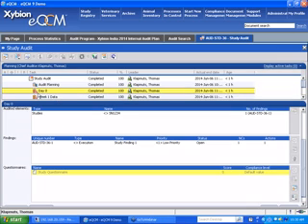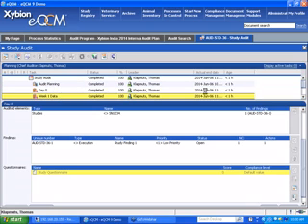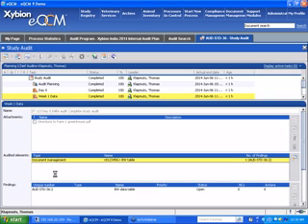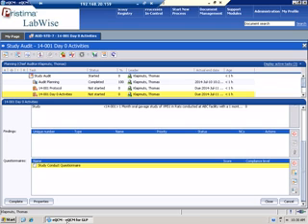And so here's an audit that I've done. Again, the same thing that I'm working through right now, day 0, week 1 data. And as I went through, everything's completed. We have the audited elements and then findings. So what I'll do is go back to the audit I was working on, although I can't open the questionnaire.